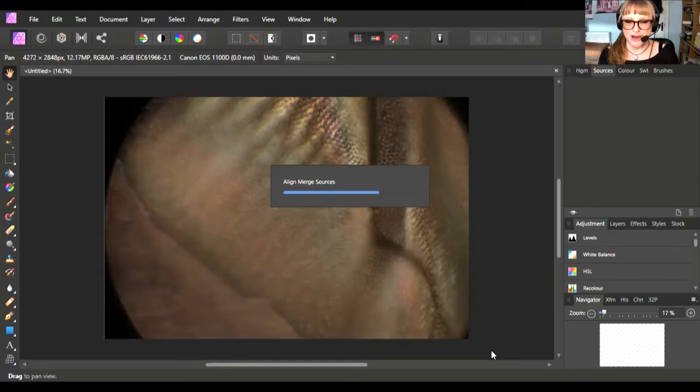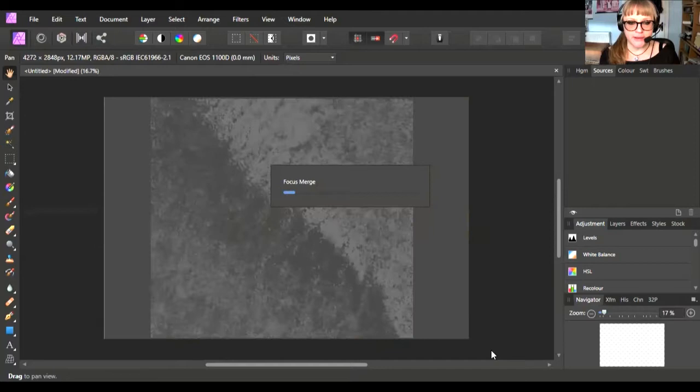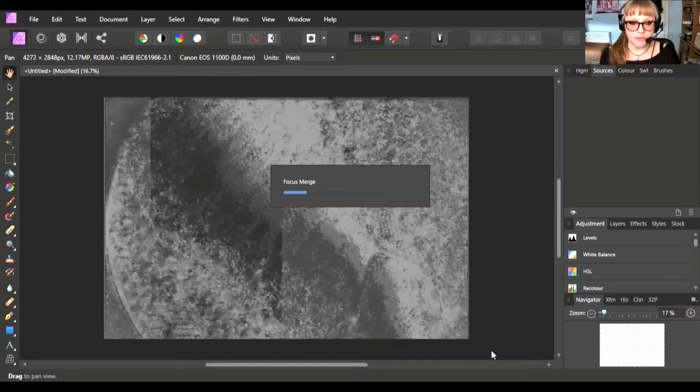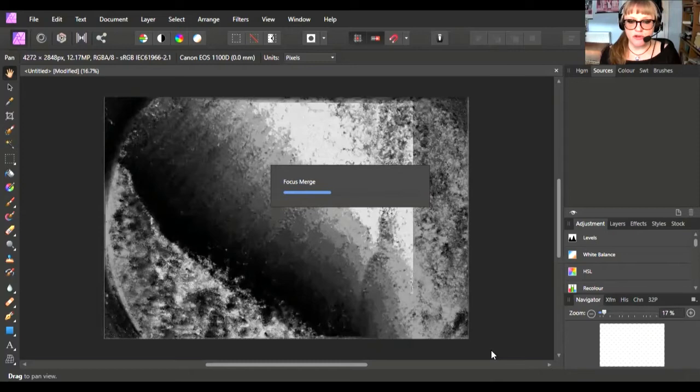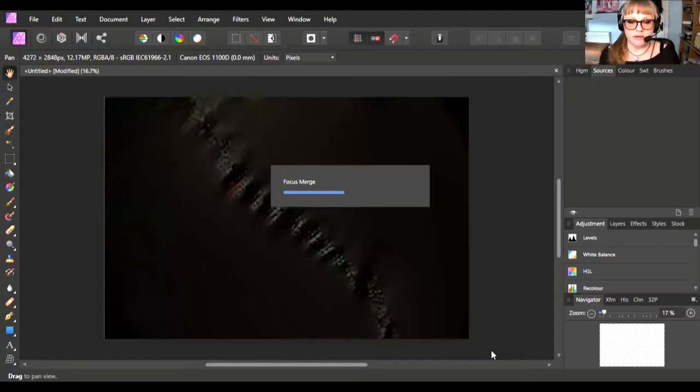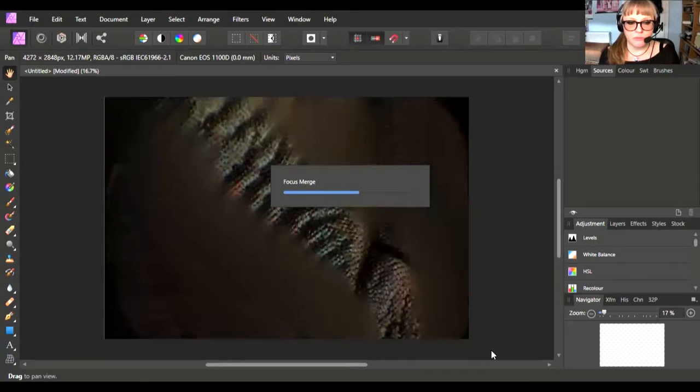It's really good that the software does all that for you. Once it's aligned everything, it starts to merge them, and it's really cool watching this happening in real time. It does it pretty quickly as well, so it kind of builds up the picture. I don't know how it does this, but it's really clever. This was a small number of images so this takes a bit longer if you do a bigger data set, but it's not actually that long in terms of image processing. Once you see it building the actual picture together, it's just really clever.